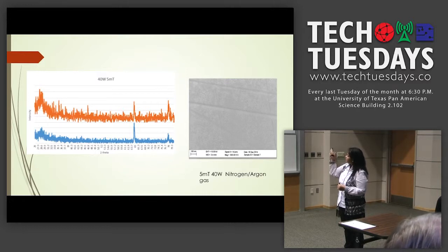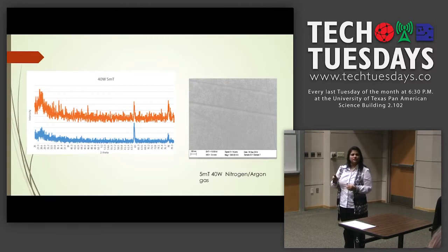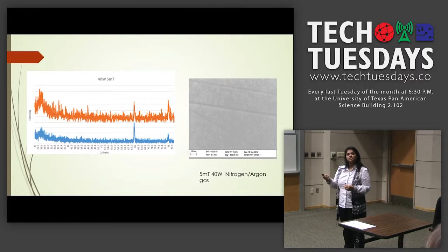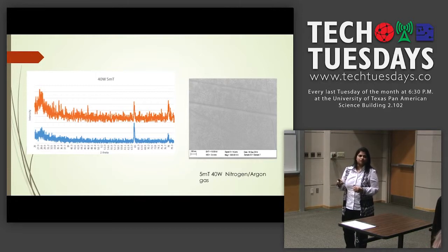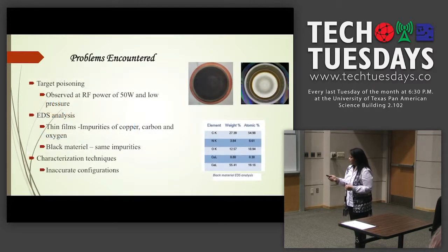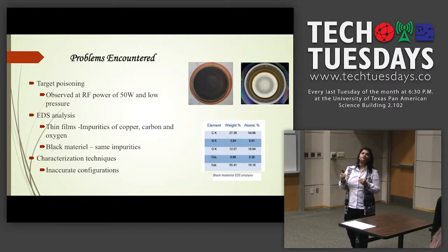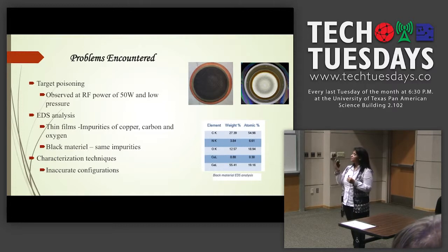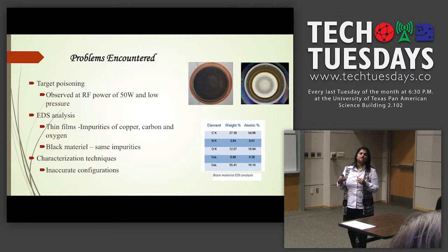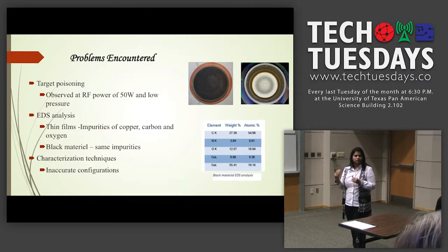The next figures show images at nanometer scale, and the surface is not uniform — we need to take precautions to improve it. One approach is increasing rotation speed, which may help achieve uniform deposition. We also observed that the two targets — one after poisoning and one after cleaning — show that if the environment is not maintained with proper parameters, we can have target poisoning.